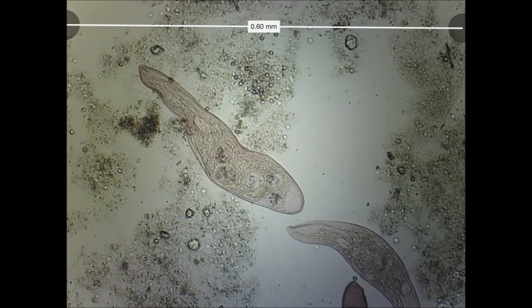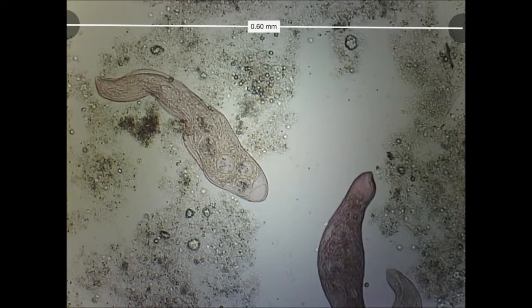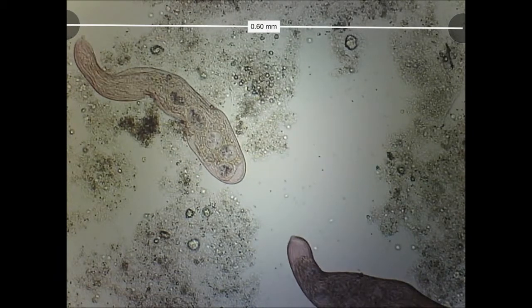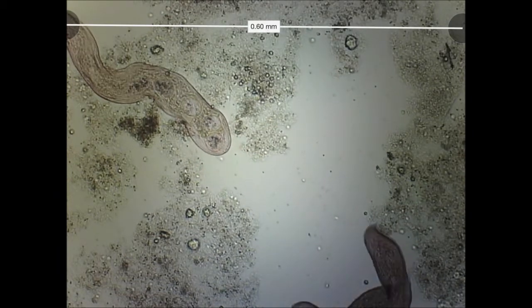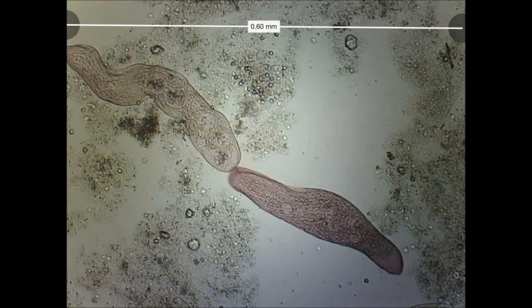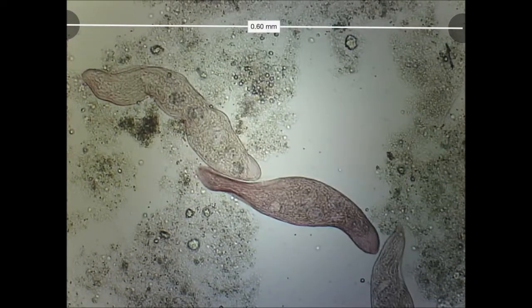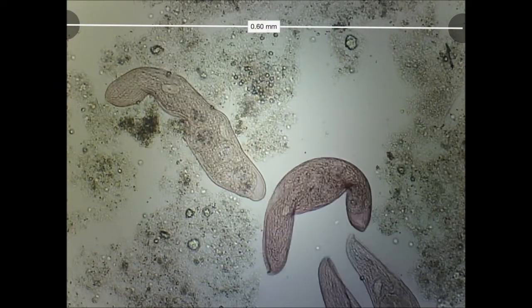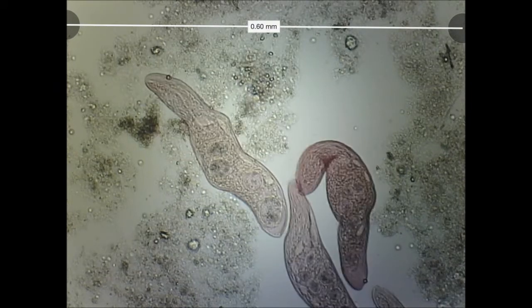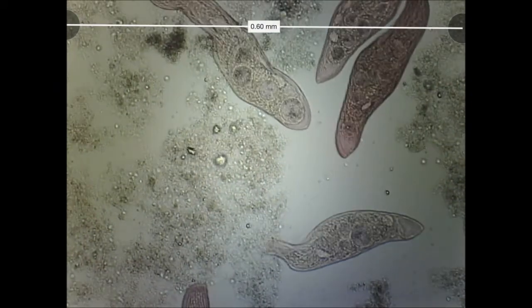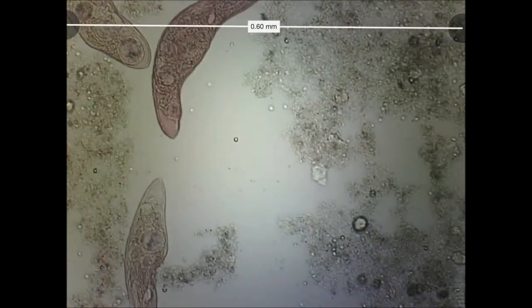You can see these guys have several food vacuoles. They are primarily bacteriovores, so they're squeezing through these little bits of bacterial mats in order to gather up bacteria, which they will digest and then eventually through exocytosis dump out through their cell membranes.